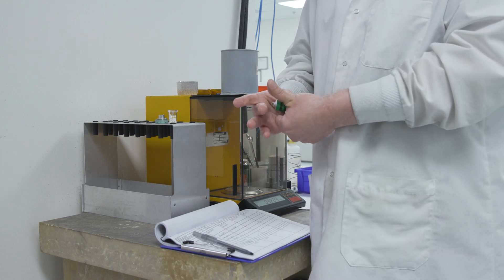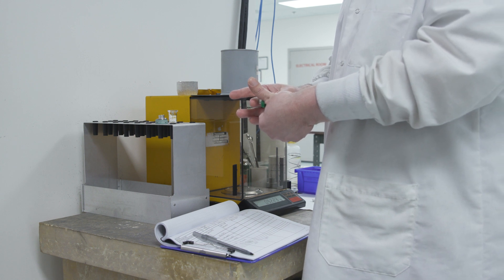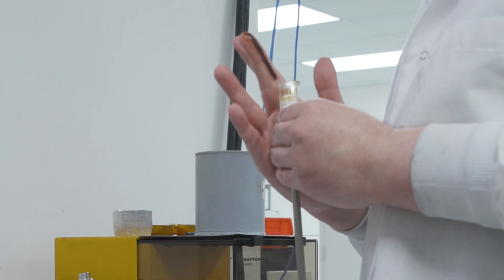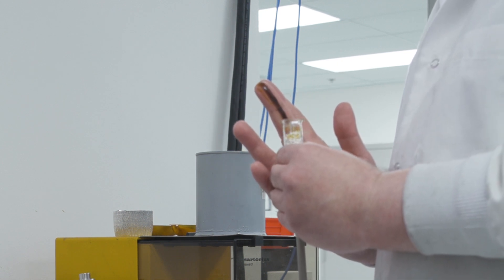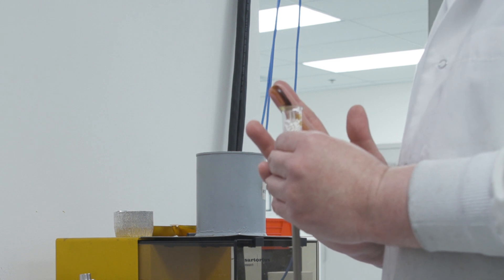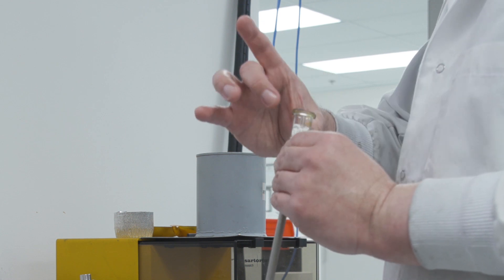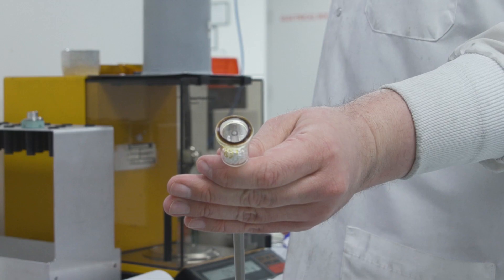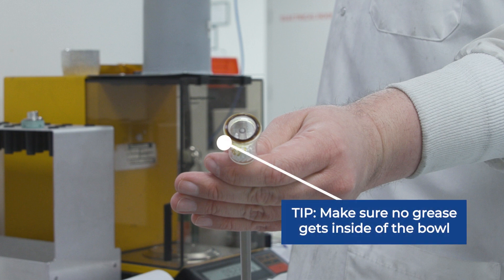Chris starts by placing a line of Apiezon H grease on his finger. He applies this grease in a thin line along the outer edge of the top surface of the penetrometer by rotating and lifting the penetrometer along the line of grease on his finger. He moves his finger around the outer edge to remove any excess grease. We do not want any grease on the inside of the bowl, as this can get onto the sample and block some pores.